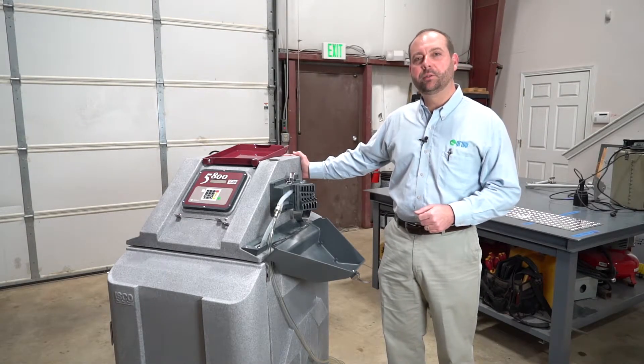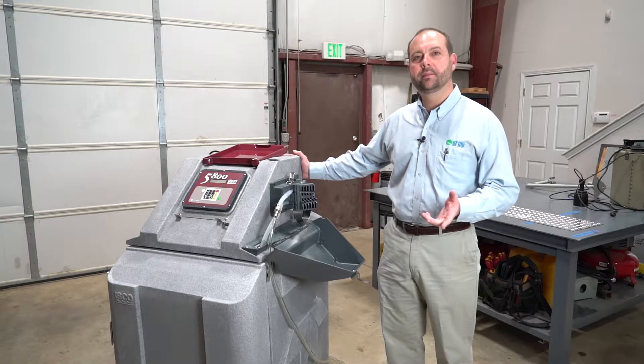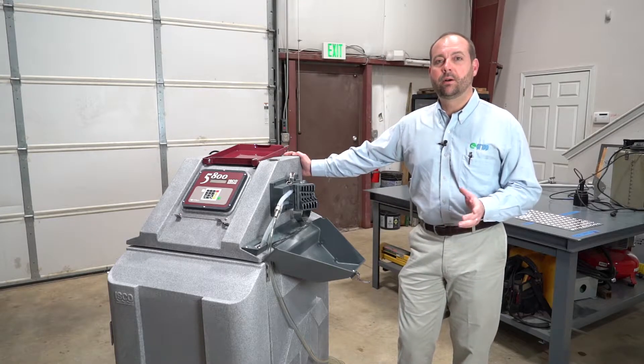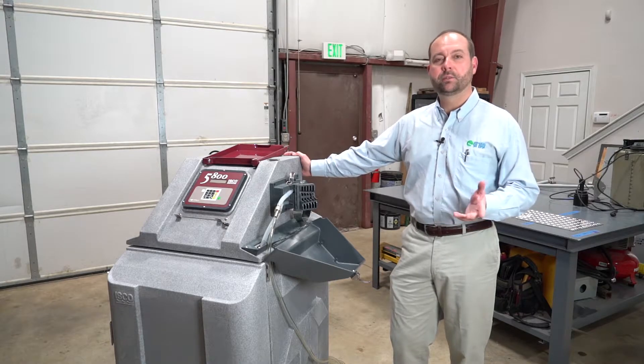Here at Gripp Incorporated, we care about protecting your equipment and we would like to share with you the proper procedure on how to replace the pump tubing in your Teledyne ISCO 5800 refrigerated sampler. Teledyne ISCO samplers are designed for easy maintenance. The pump tube replacement can be easily done in just a few minutes.